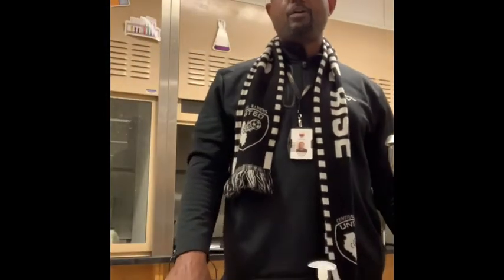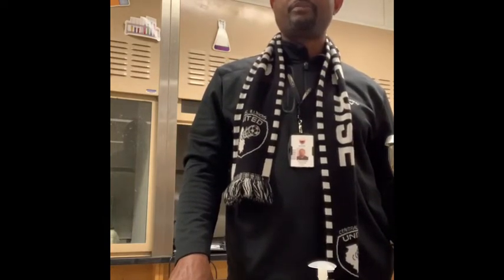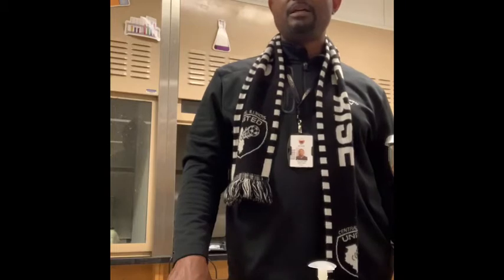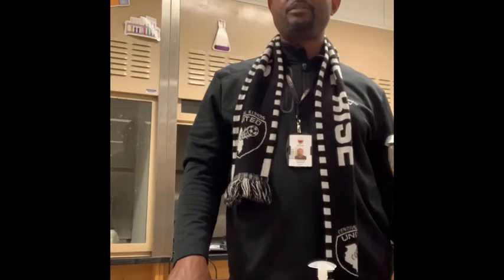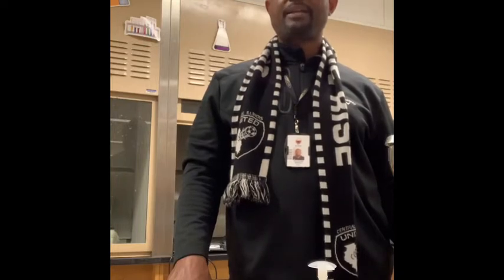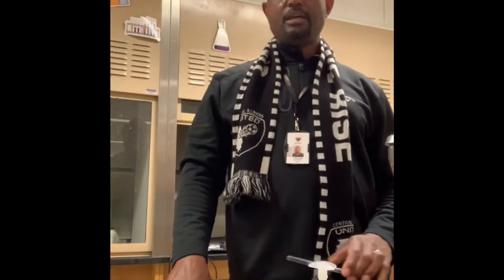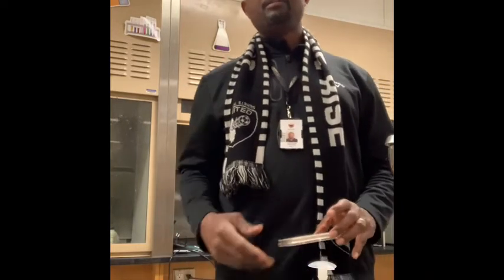Another aspect of water quality is fecal contamination. This is a source of biological pollution where fecal matter from animals, whether it be birds or other animals around, enter the water and cause the proliferation of bacteria. The bacteria that we use as an indicator is coliform bacteria. And so in our water quality study, we are going to perform a coliform bacteria test on our water.